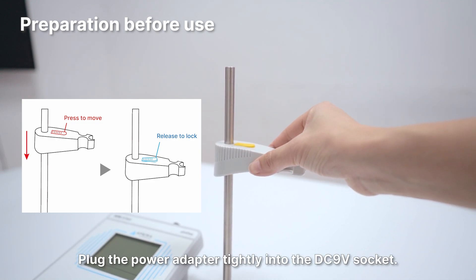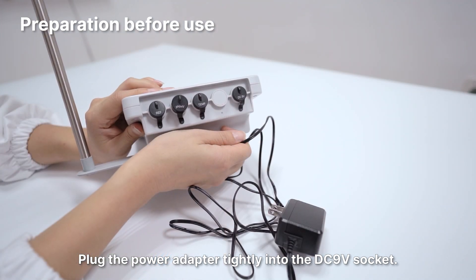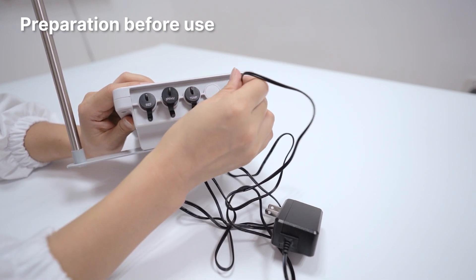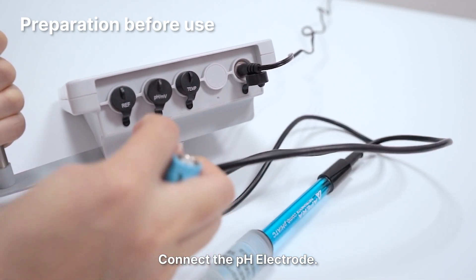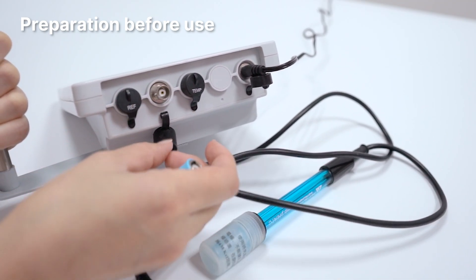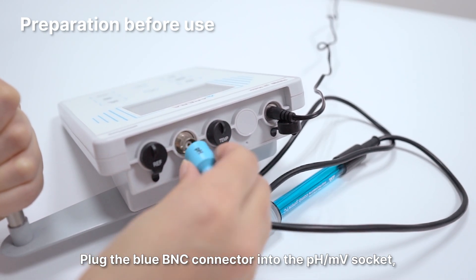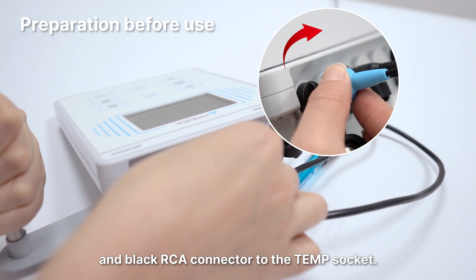Plug the power adapter tightly into the DC9V socket. Connect the pH electrode: plug the blue BNC connector into the pH or MV socket, and the black RCA connector into the temp socket.